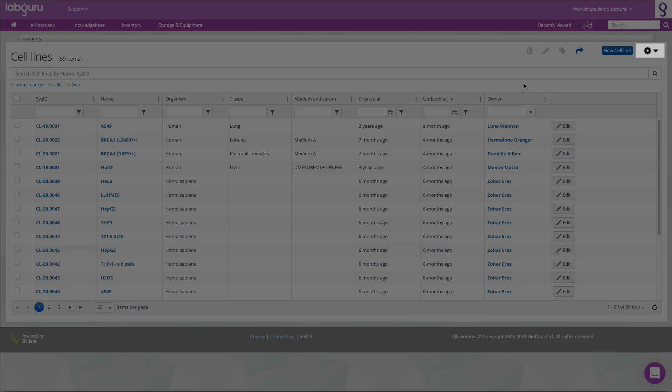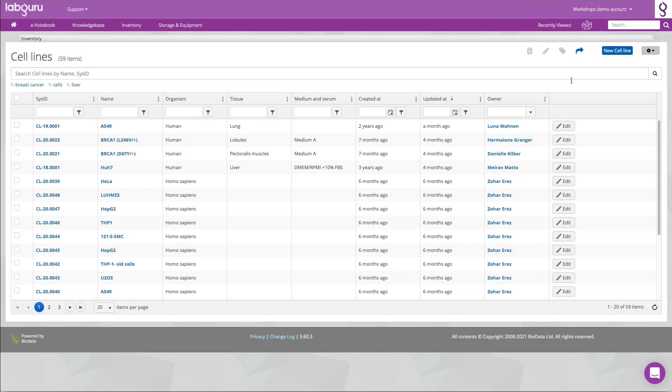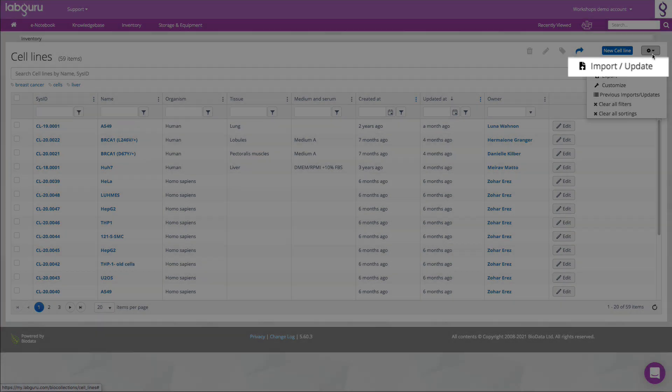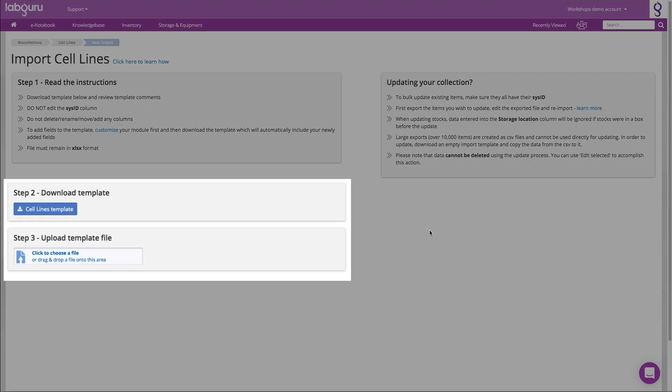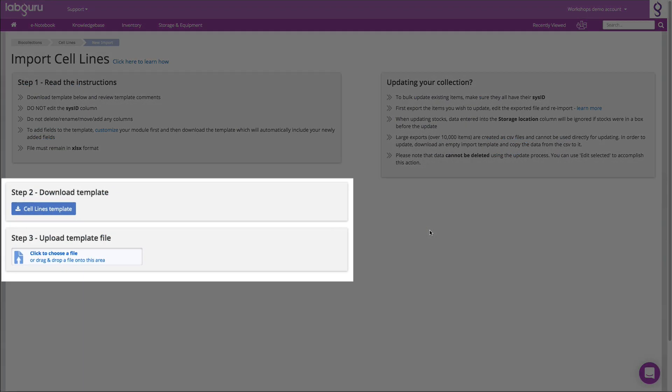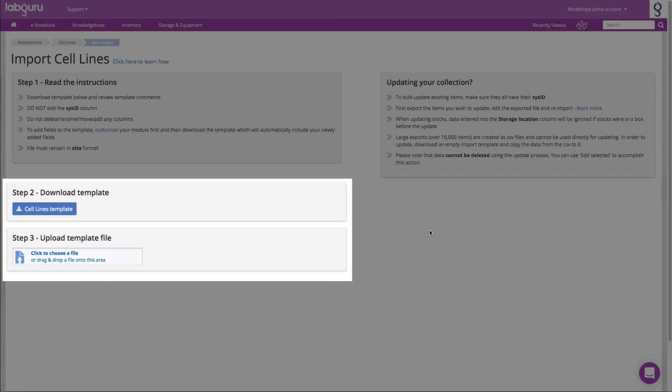The second option is to import all of your inventory items as a group. This will remind you to customize the fields and then download the template to import.